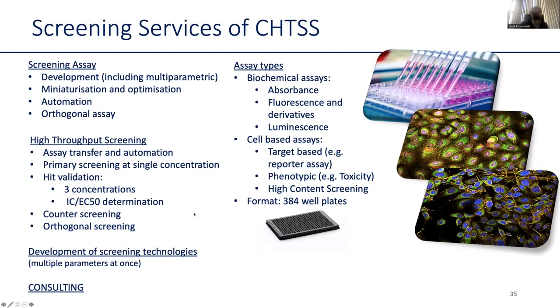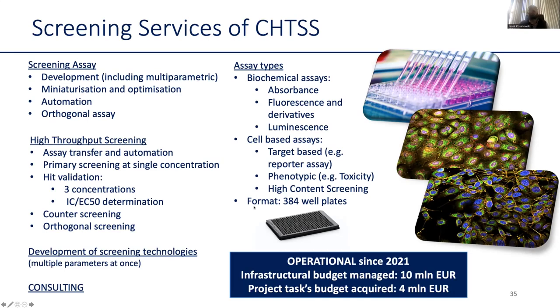So in our services on the screening level, we do all of this standard assay development and high throughput screening. We also really focus on development of screening technologies. We look for new screening technologies, especially the ones which allow us to use multiple modalities of detection together to have these multiple assays, and we work on development of these multiple assays. We are operational truly since 2021. And since that time, we've been managing an infrastructure budget of over 10 million euros and recruited our own budget of over 4 million euros.